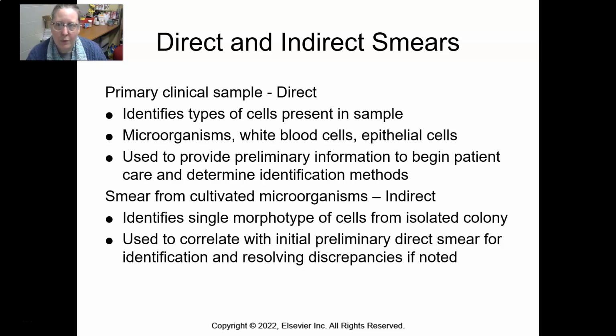And then we set up the culture on the plates, and if that organism, the gram-positive cocci, grows, and we can see that the colony types all look identical, then it's the same morphotype that turned into the growth on the plate. And then you can gram stain specifically that colony to verify that you still have those gram-positive cocci.